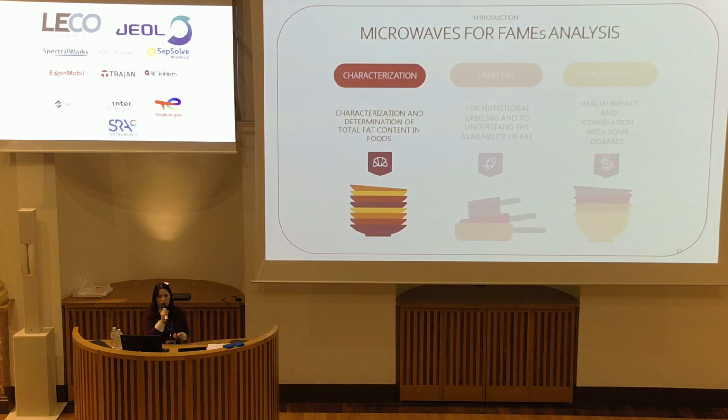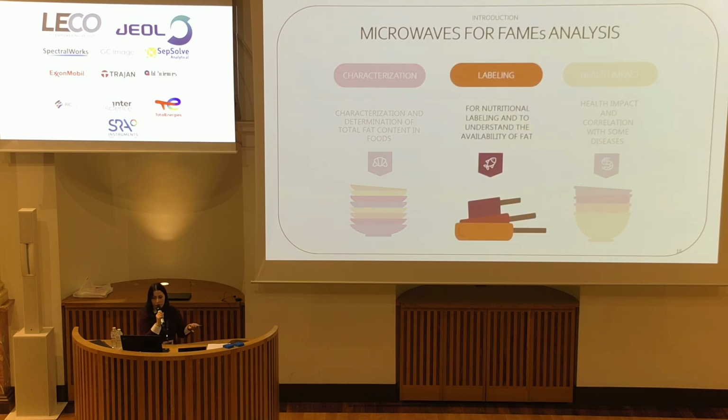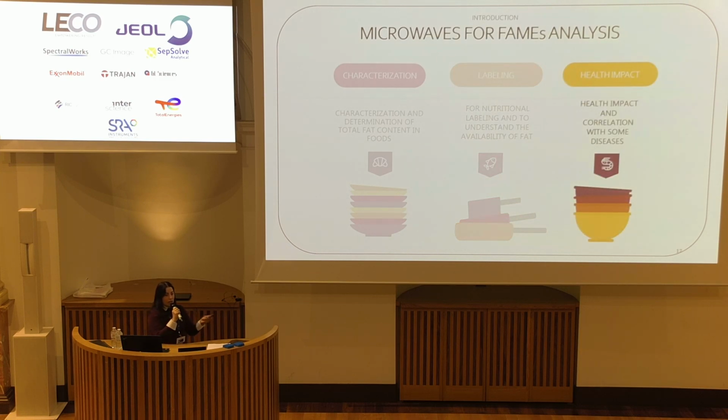We wanted to use this technology for the analysis of FAMES. FAMES, fatty acids, are a basic unit of fats and oils, and their analysis is important for the characterization, determination of total fat in food. It's important for labeling, so for nutritional labeling, understanding the availability of fat, and also for health impact, so to understand the correlation with some human diseases.